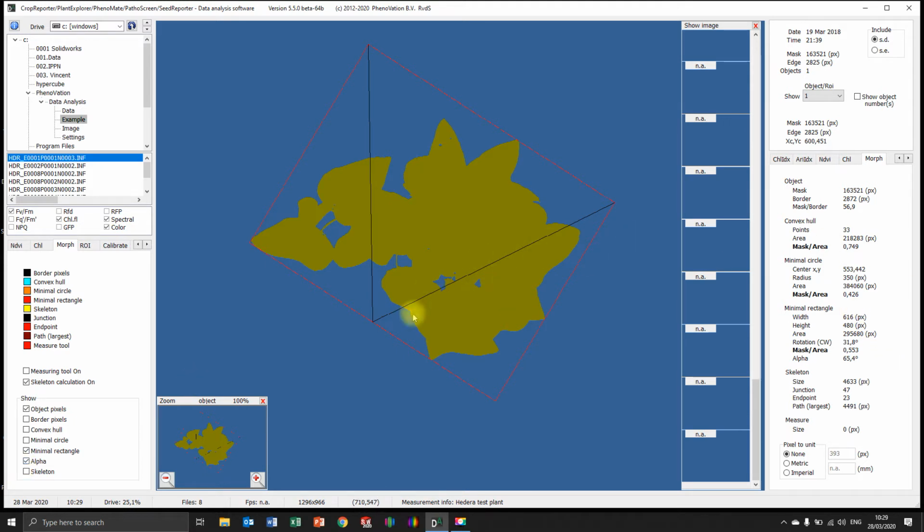We have incorporated this because we had a customer that wanted to measure the corners of a banana. So now with the alpha, we can perfectly measure what the alpha is for a banana. And it's calculated here.